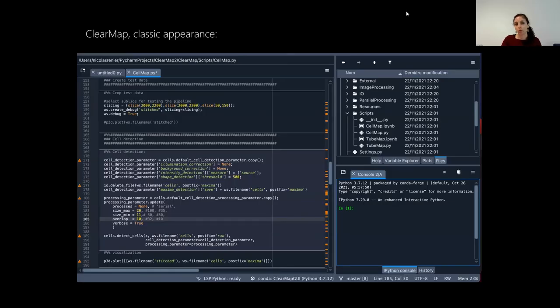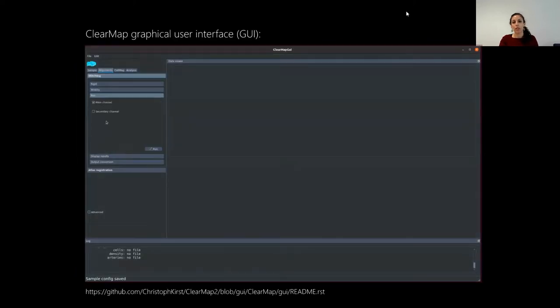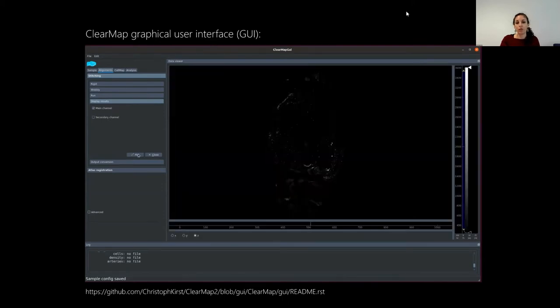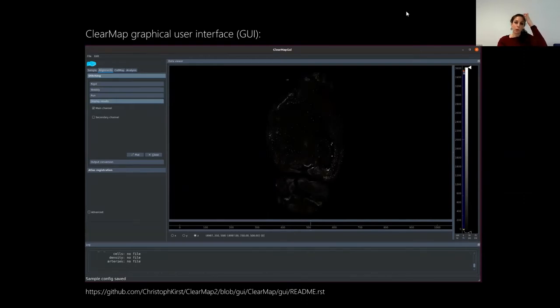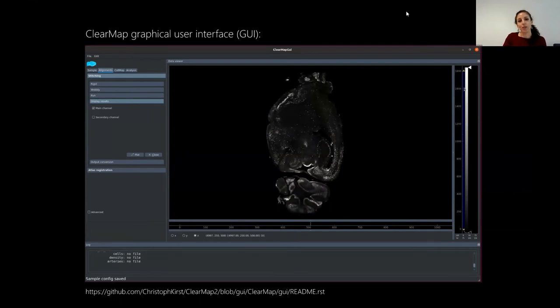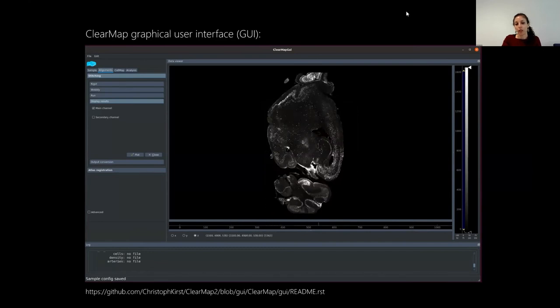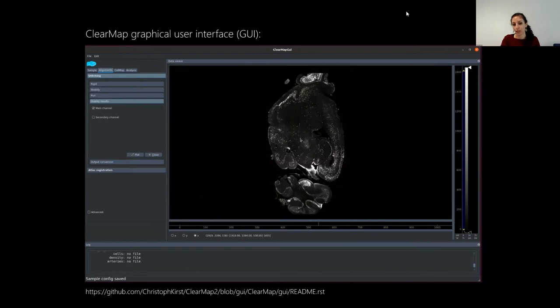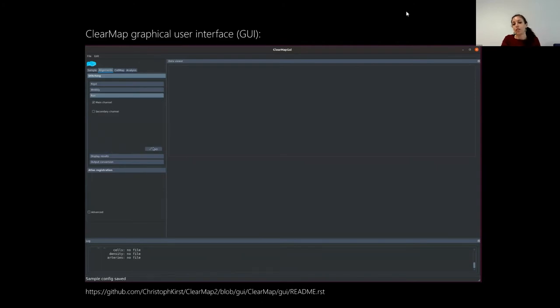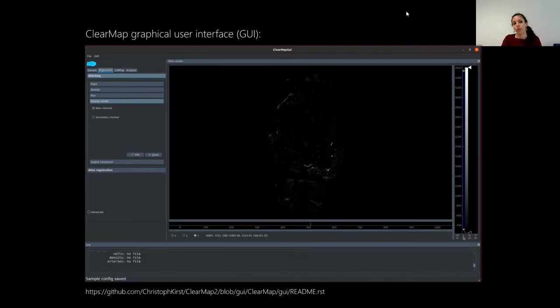ClearMap used to be a Python script. Charlie Rousseau in our lab is working on a graphical user interface to make it more accessible for users without coding experience. It's still in development, but you can already get it on GitHub, try it, and send feedback for improvement. With this new tool, you can easily display data, run cell detection across the entire brain, and perform the full analysis.